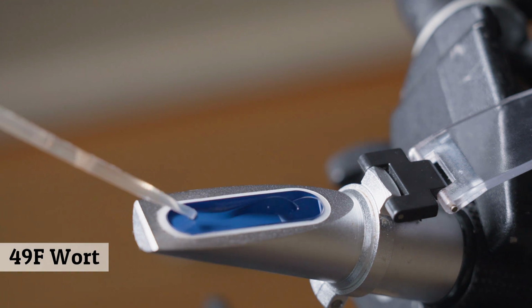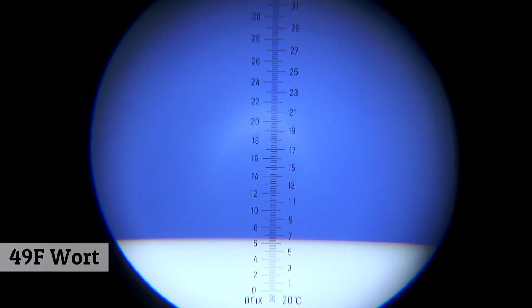Okay, so put the sample on the platter. And this sample came in fairly close to the original. This one's about 6.6. So that's kind of interesting. But in general, still fairly accurate. Now what I'm seeing with the chilled sample is that it's actually going down as time goes by, which is pretty interesting. As you can see, at this point we're almost approaching the original wort reading. So that's something to keep in mind, that maybe with your post-chilling gravity reading, you might want to give it a minute or two, let it settle out before you actually record that reading.